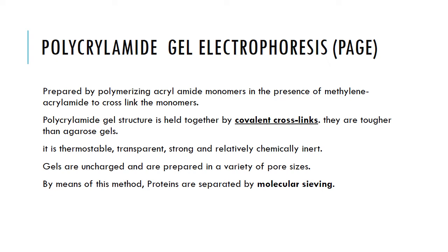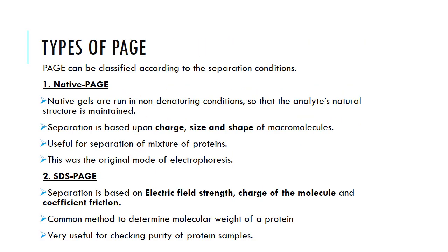Gels are uncharged and are prepared in a variety of pore sizes. By means of this method, proteins are separated by molecular sieving. So thanks to the ability of preparing them in different sizes, molecular sieving is very much possible.